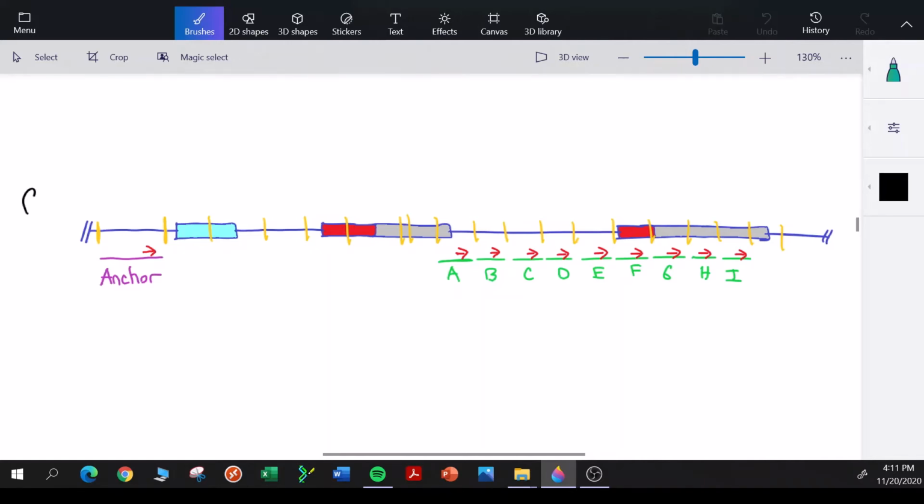But beyond that, after all those steps, what they're going to need to do is choose a restriction enzyme, and I believe they use an enzyme called BstYI. So BstYI is going to cut DNA throughout the genome at wherever there is a BstYI site. And I believe, you don't have to remember this, but it looks something like this: RGATCY. That would be the restriction enzyme recognition sequence. R stands for purine, and Y stands for pyrimidine. And it's going to cut DNA throughout the genome in those fixed cells, those cells that have been treated with formaldehyde, wherever there is one of these sites.